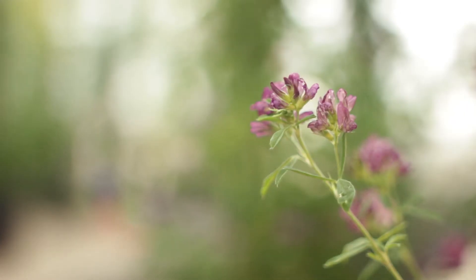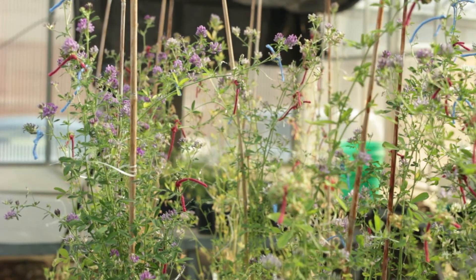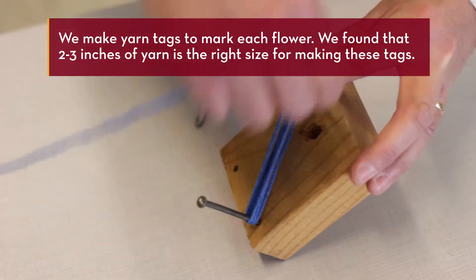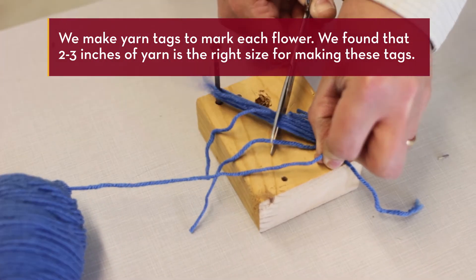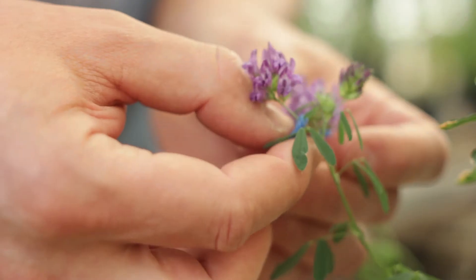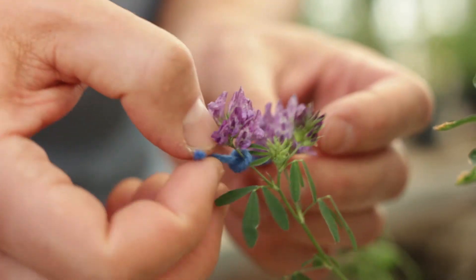The day before crossing, select the three racemes on each plant that will be used. The raceme should have all open flowers. Tie a 2-3 inch piece of colored yarn on the peduncle of each raceme to be used.